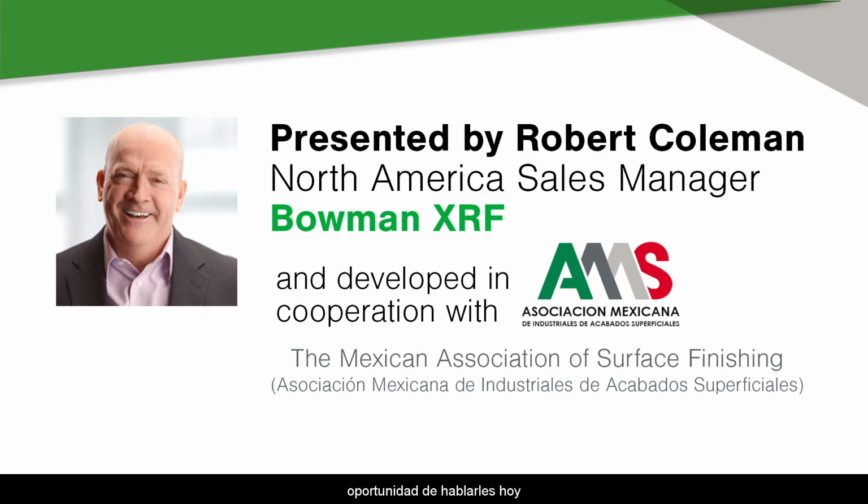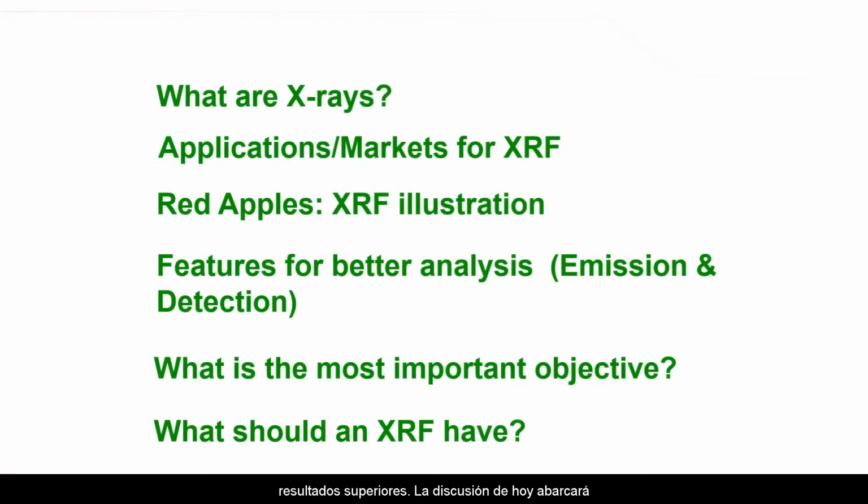I would like to thank you for the opportunity to talk with you today about XRF and the equipment attributes that are essential to providing superior results. Today's discussion will cover the following topics. What are X-rays? What applications and markets are there for XRF? I'll go through a red apple's XRF illustration. We'll discuss the features for better analysis, specifically emission and detection. What is the most important objective of XRF? And what should an XRF have?